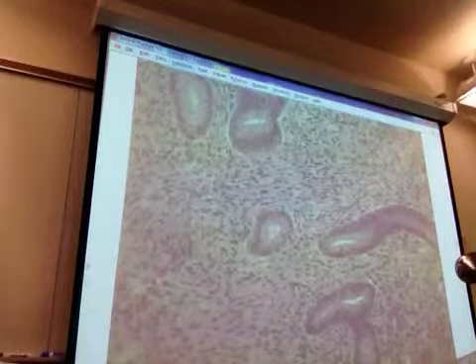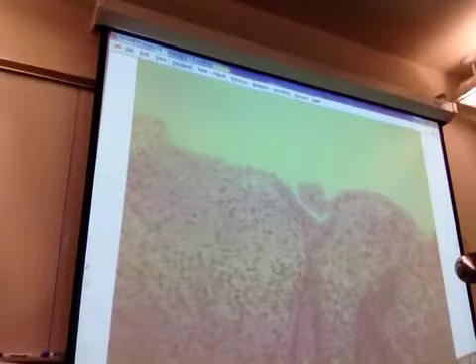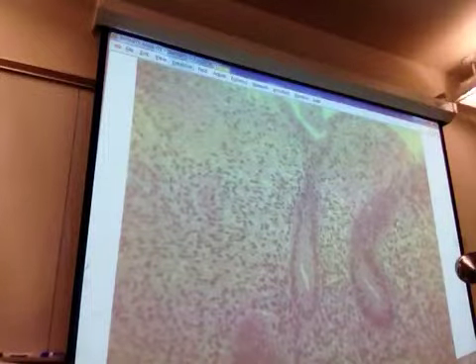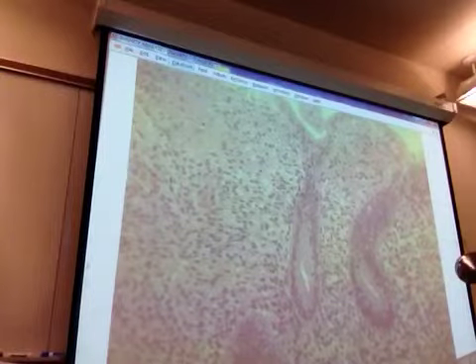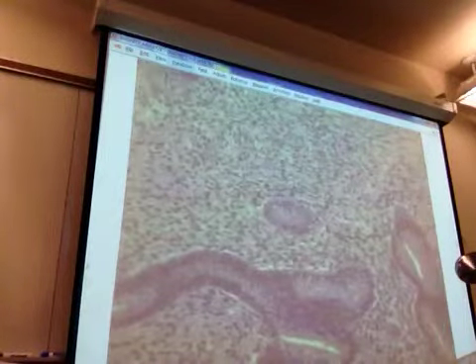So what kind of epithelia are those? Because those don't look cuboidal to me. The ones down below, like those. These guys? Like almost stratified. No, not those. Well, remember, glands are cuboidal. No, everything else, like all those cells. So like what would be lamina propria, you know?